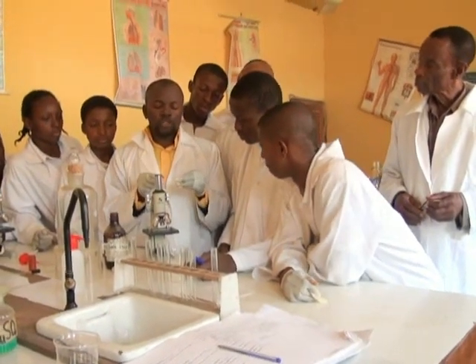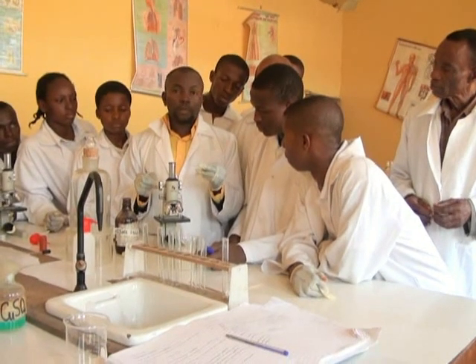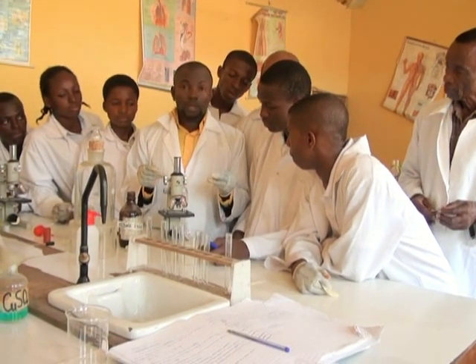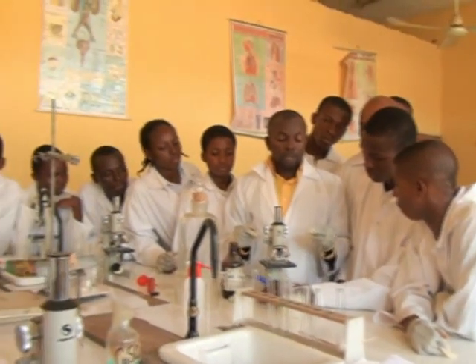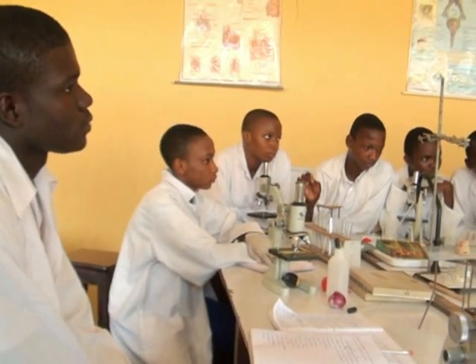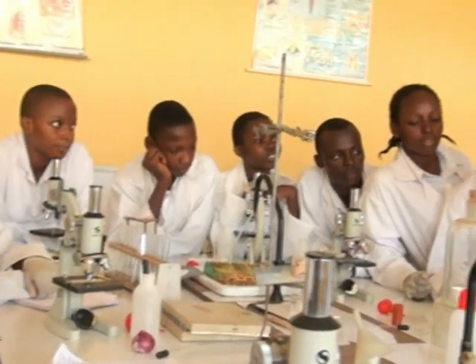But if you cannot see the organisms clearly, we can now apply stain. Iodine stain, methylene blue, can be applied and then examine accordingly. The microorganism that we are likely to observe here is yeast, which causes what? Fermentation.